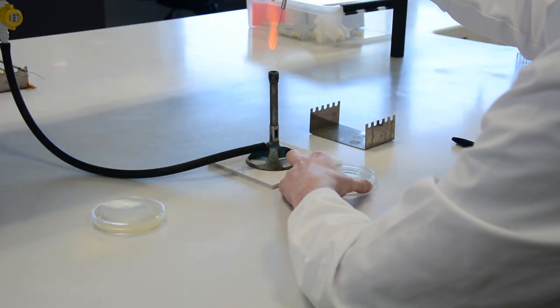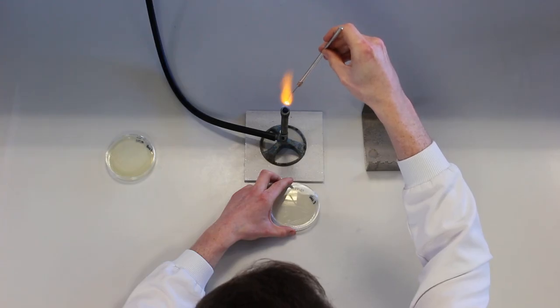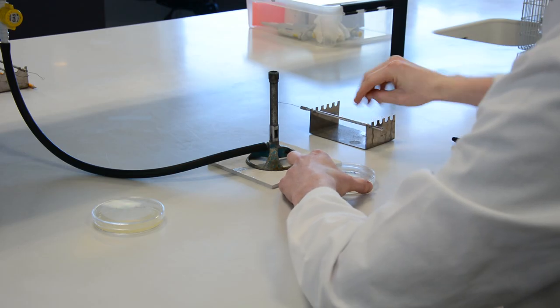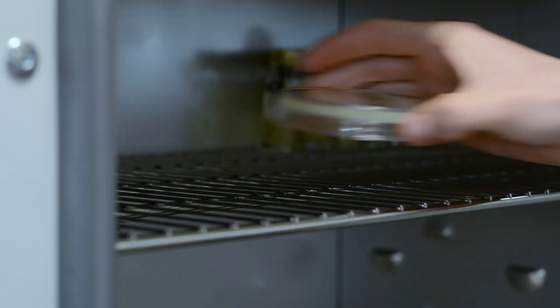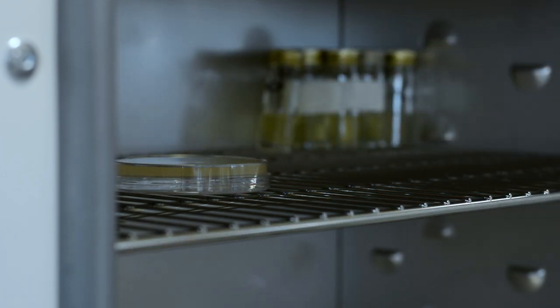Streak plates are inverted to avoid condensation flooding the agar and incubated usually overnight. 37 degrees Celsius is the incubation temperature used for bacteria capable of growing in the human body. If material has been collected from environmental sources, then a lower temperature may be used.